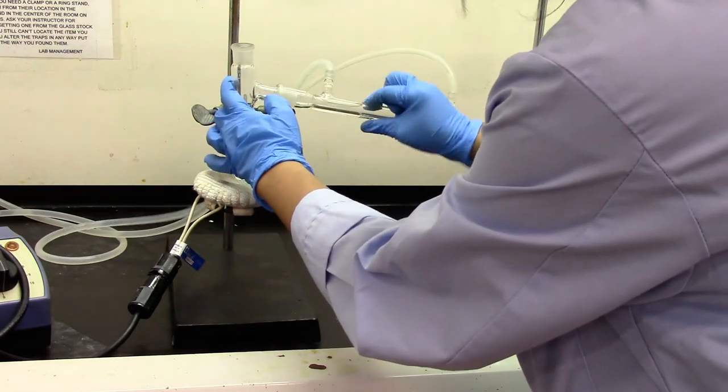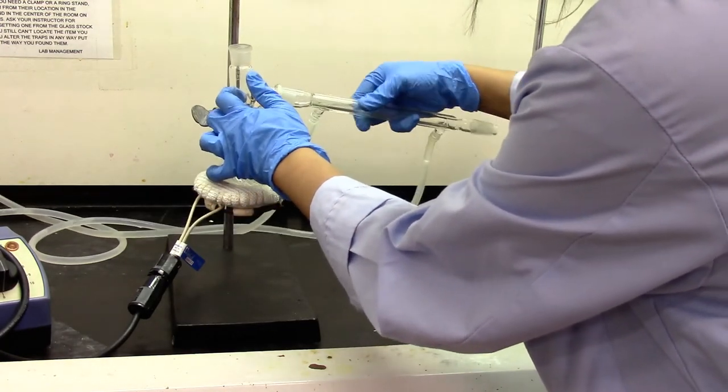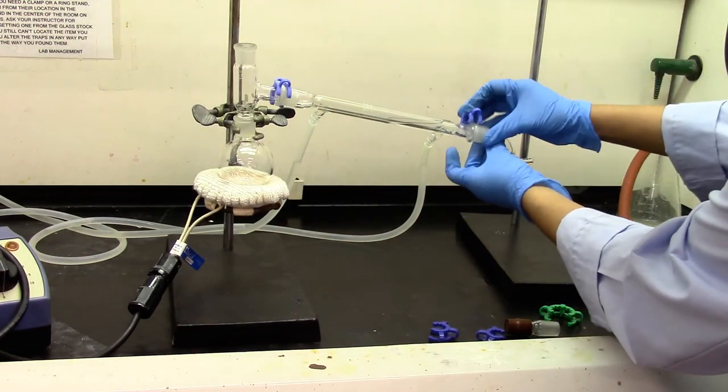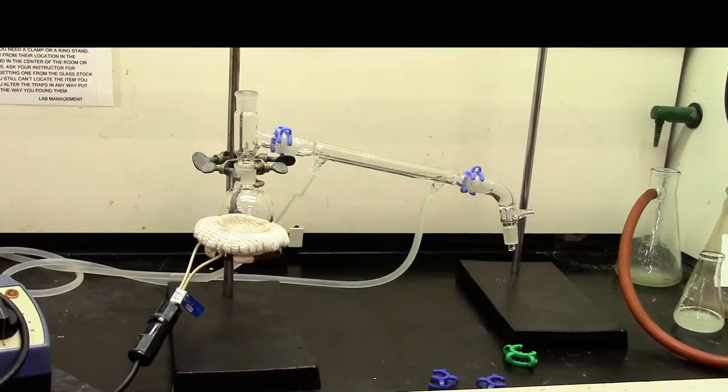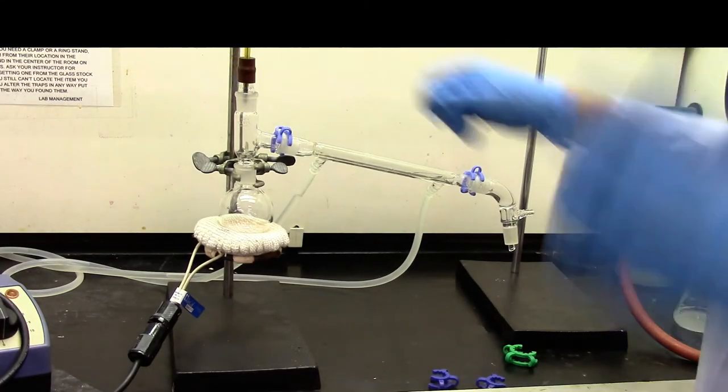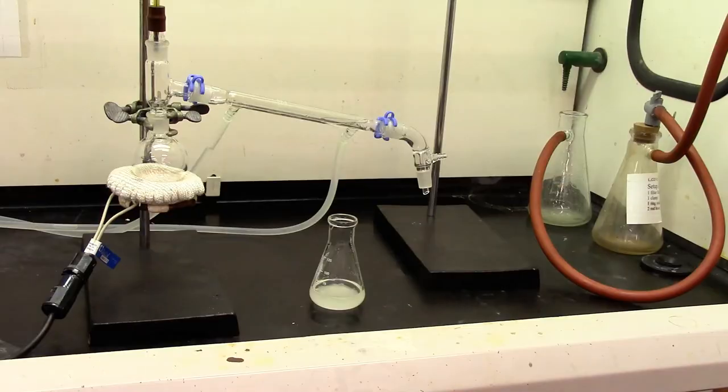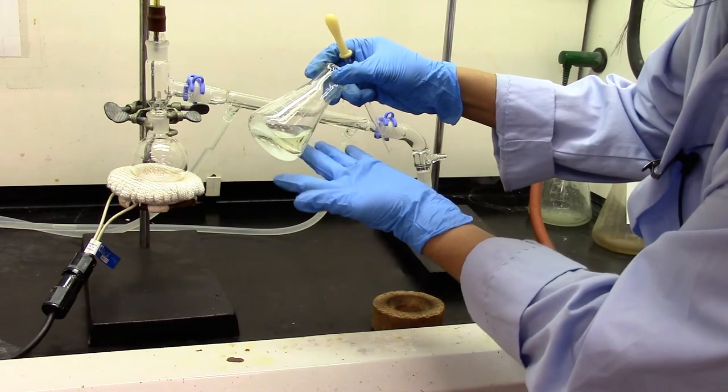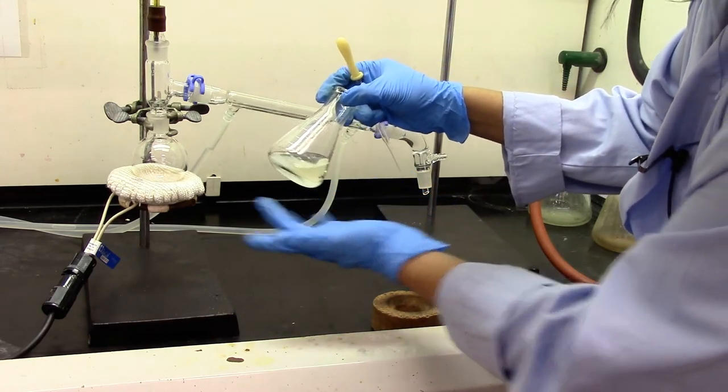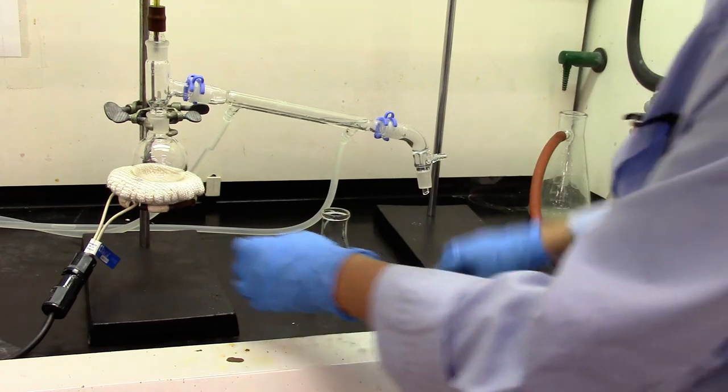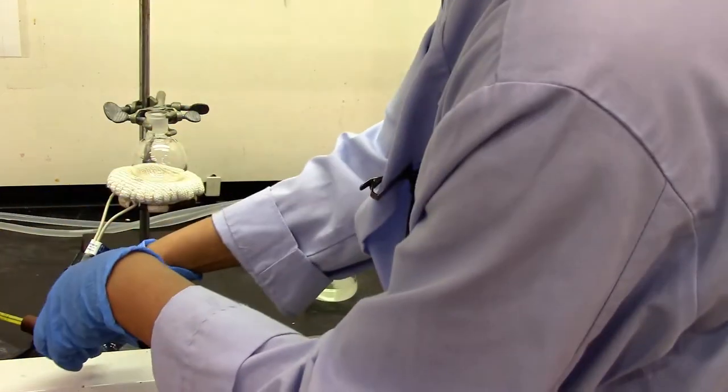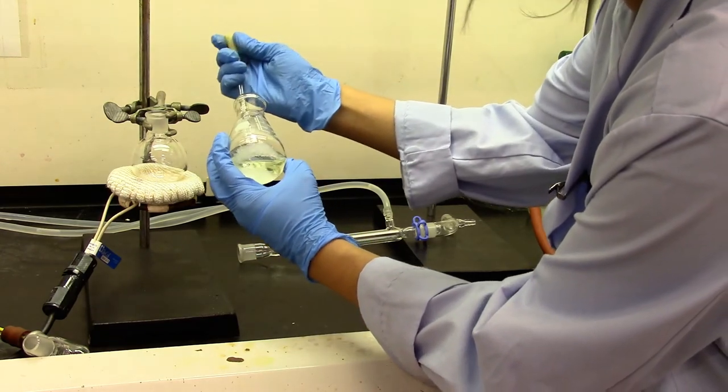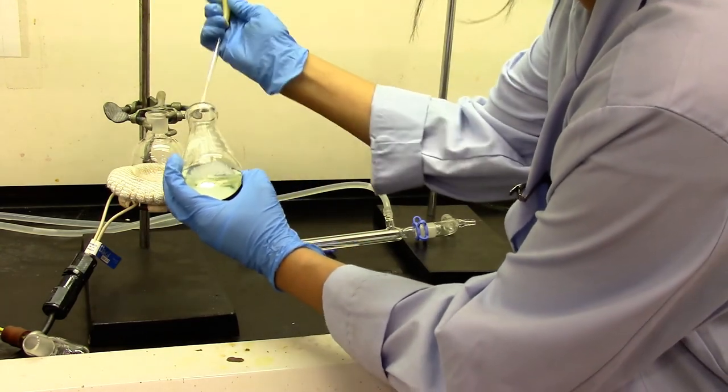I'm going to quickly set up a simple distillation. I'm going to quickly transfer my dichloromethane layer from here to the round bottom flask. So tilt the Erlenmeyer flask. Transfer just the liquid onto the round bottom flask.